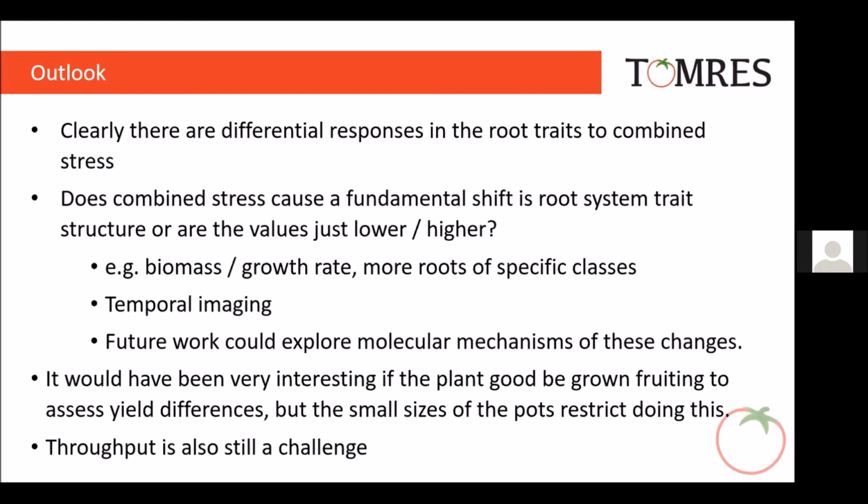The growth isn't quite as much under the drought conditions. We'd like to explore this a bit further. We've done this with temporal imaging, and obviously we'd be keen to explore the molecular mechanisms behind some of these changes.